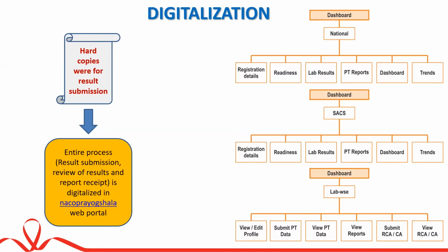In the dashboards, the overall scenario of the state will be displayed, which will be discussed by my colleague, Mr. Ajit Kumar, in the next session. And then the last one is the trends. So you can view the trends of the participation and the success of the laboratories. This is what the SACS module has. So if anyone has questions, we can discuss them. The next session is conducted by my colleague Ajit Kumar.